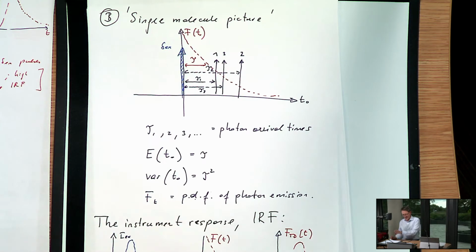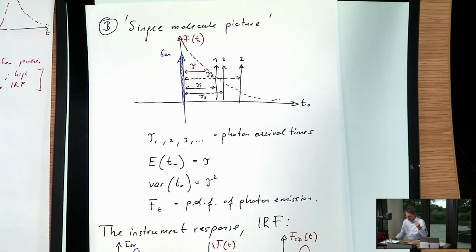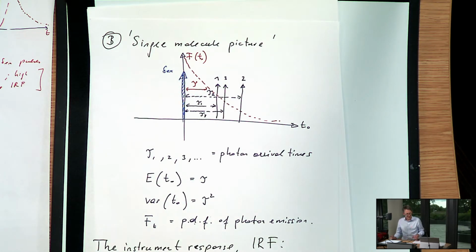So you understand the physics of it. There's not more in it in terms of what goes on, but the detail is just technology, and people know how to deal with this. You measure the instrument response on something that has a very short lifetime.